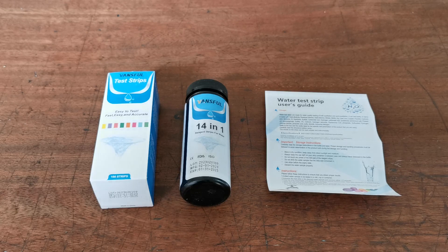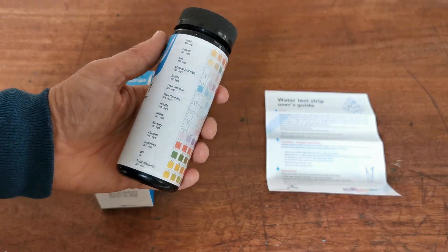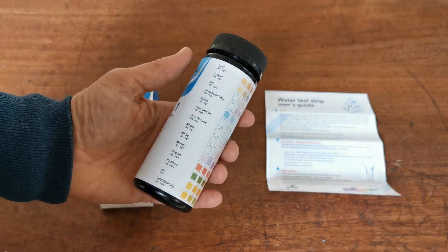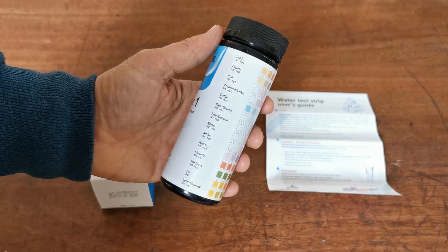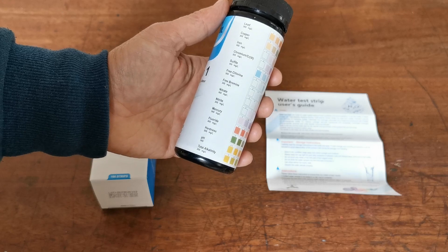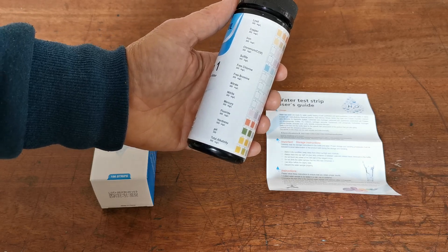The 14-in-1 water test is intended for home testing, self-testing, and water quality testing. It can be used across a range of different waters, but the most useful test is with drinking water to ensure quality and contents don't exceed recommended levels. This strip screens for lead, copper, iron, chromium, sulfites, free chlorine, free bromine, nitrite, nitrate, mercury, and fluoride, and also gives an indication of hardness, pH, and total alkalinity.